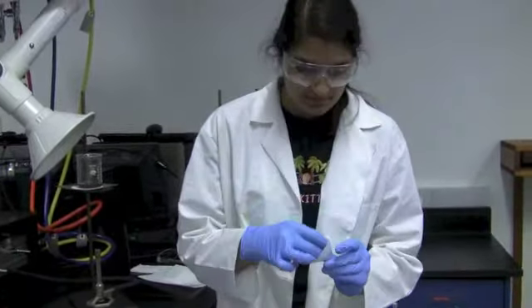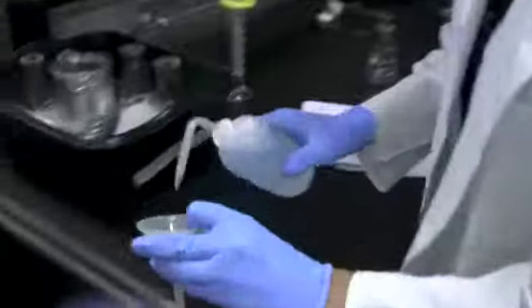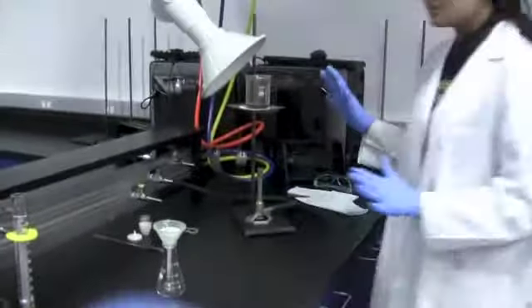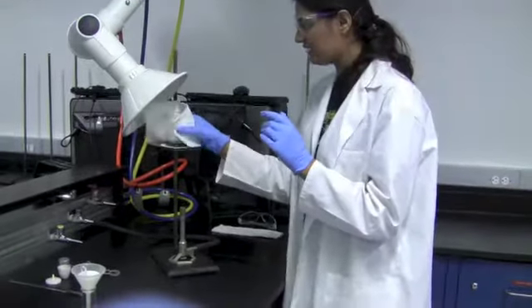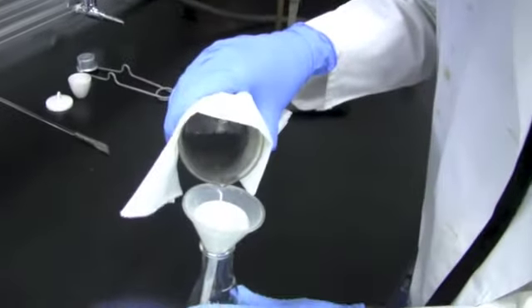You're going to open the filter paper and place it inside your funnel. And to get the paper to stick to the funnel, you're going to take your wash bottle and just lightly wet the edges. You're going to now place the funnel inside the flask. And remember, you're filtering while the solution is still hot, so you're going to want to hold it very carefully with paper towels. Bring it over to your flask and slowly add the solution.